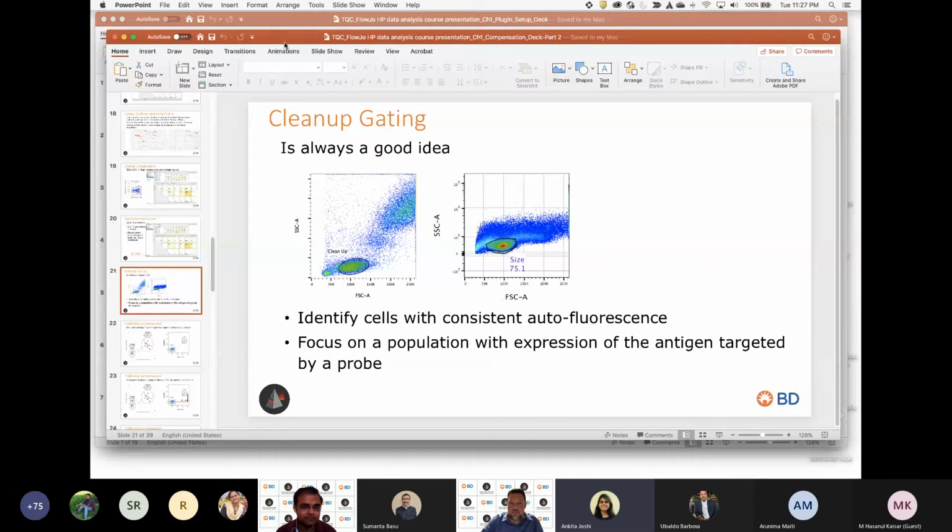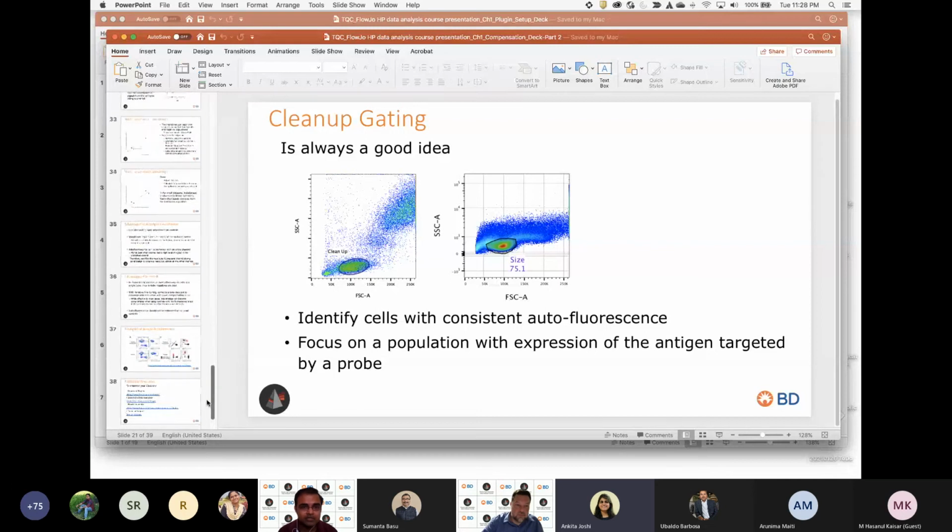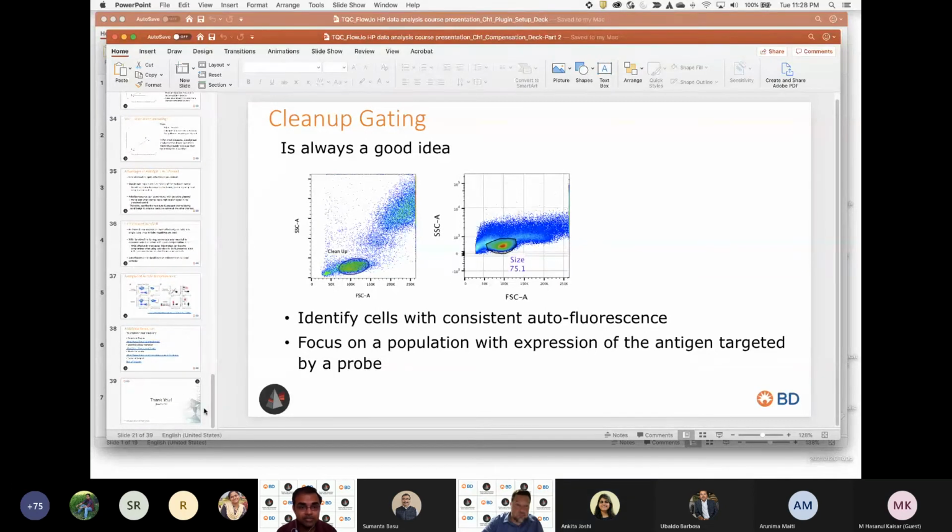So we can have the fourth and last question for the session. It's live now, Amlan. You can read it. Okay, what is the one advantage of AutoSpill over traditional compensation? A, it is extremely fast, faster than traditional compensation. B, it is possible to perform autofluorescence extraction provided an open channel is provided. C, it is less demanding on gating. And D, both B and C are correct.